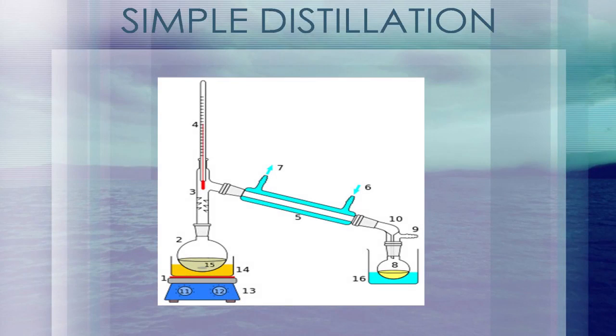Simple distillation. In simple distillation, the vapor is immediately channeled into a condenser. Consequently, the distillate is not pure, but rather its composition is identical to the composition of the vapor at the given temperature and pressure. That concentration follows Raoult's law. As a result, simple distillation is effective only when the liquid boiling points differ greatly, or when separating liquid from non-volatile solid or oil. For these cases, the vapor pressures of the components are usually different enough that the distillate may be sufficiently pure for its intended purpose.